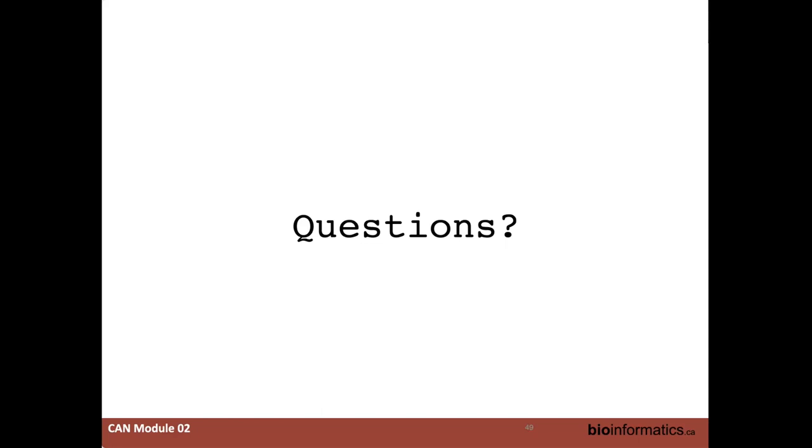That is such a great question. The answer to that is, it depends. Worst answer I could possibly give, but yes, it depends. Do they update it? Yes. Sometimes you'll actually see suffixes to a reference genome, like dot one or dot two. And it tells you that they're progressing and they're actually figuring out more bases that were once upon a time N, or they're fixing positions, things like that.